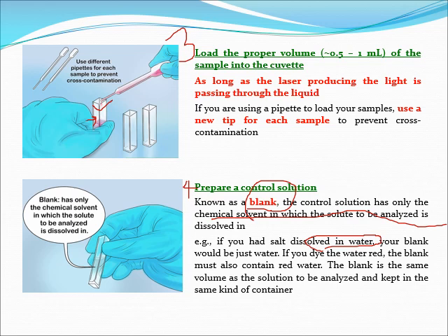Biasanya guna water lah. Kalau you nak study antioxidant activity, you guna blank adalah yang mana tak ada treated with antioxidant, tu kita panggil blank. Tapi kalau nak just measure the amount of quercetin, for example, inside the extract, dalam you punya sample, so blank you boleh guna water saja. Okay, and then you letak, your water will be your blank, and your sample tu adalah extract lah yang you dah prepare.